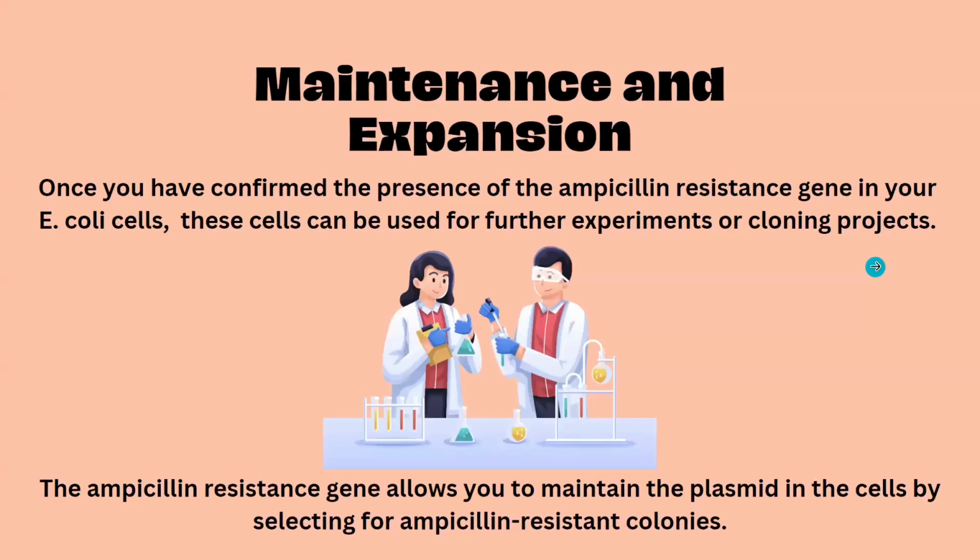And the last step is maintenance and expansion, which is once you have confirmed the presence of the ampicillin resistance gene in your E. coli cells, these cells can be used for further experiments or cloning projects. The ampicillin resistance gene allows you to maintain the plasmid in the cells by selecting for ampicillin resistant colonies.